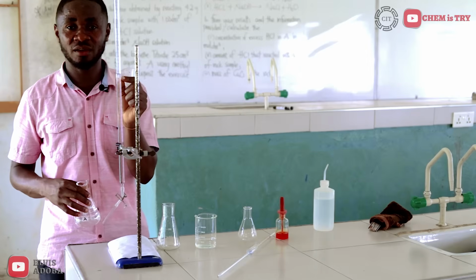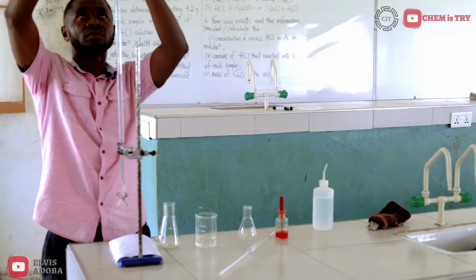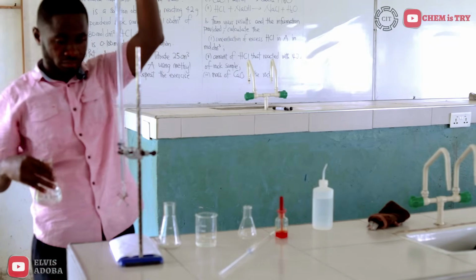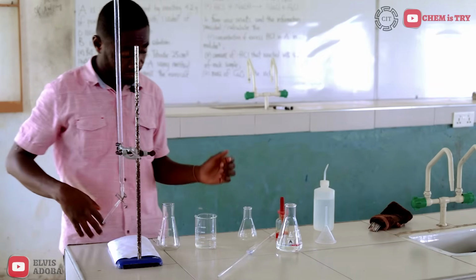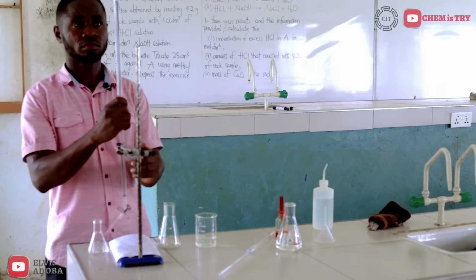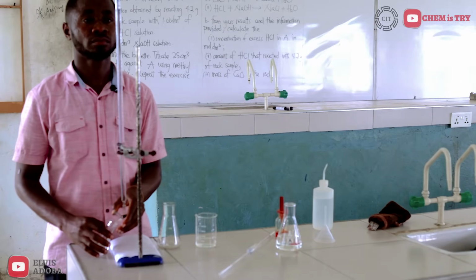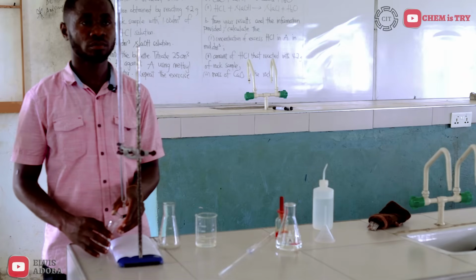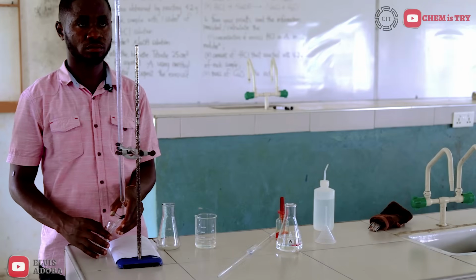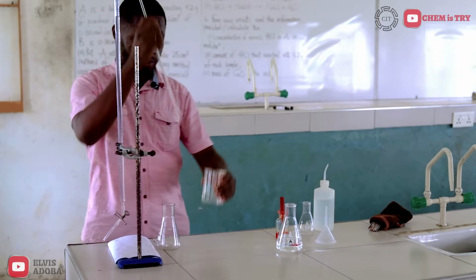I could choose to continue from here for my second titration, or I could top up to my 0th mark and start from that place again. I'll be speeding up. Then I pipette my solution B.